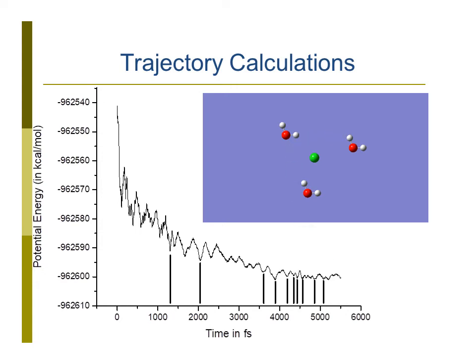So you just give the molecule a certain energy and a certain temperature, and then the program calculates variations of the structure.